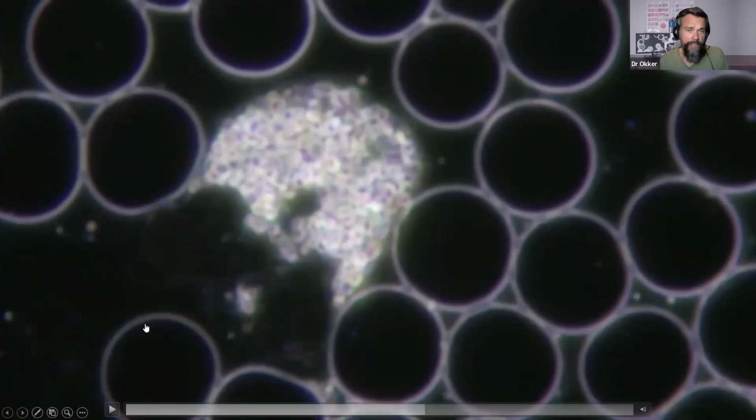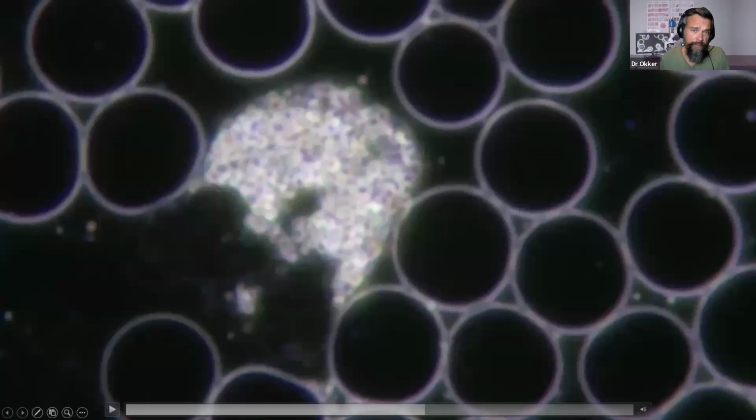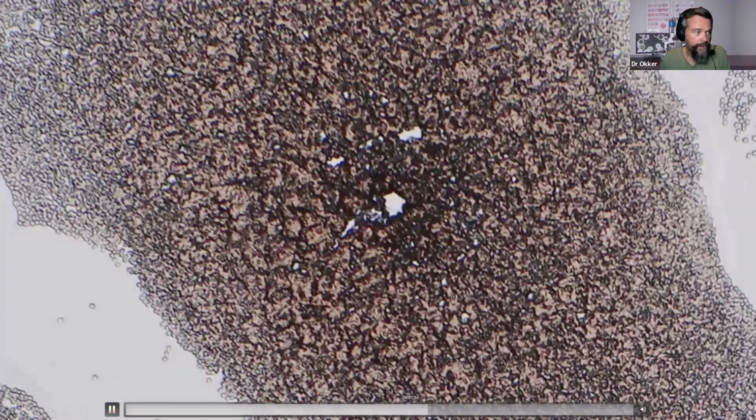So that's usually a specific anomaly called delayed clearance of chylomicrons, and that is also related to fat metabolism, often connected to things like metabolic syndrome and issues with fat metabolism by the liver. All right, another nice white blood cell here. This is a close-up of a basophil, and we can see the granules within the cytoplasm moving around.